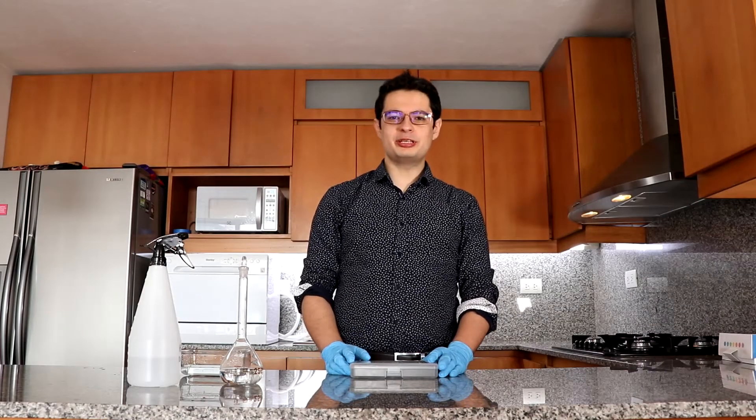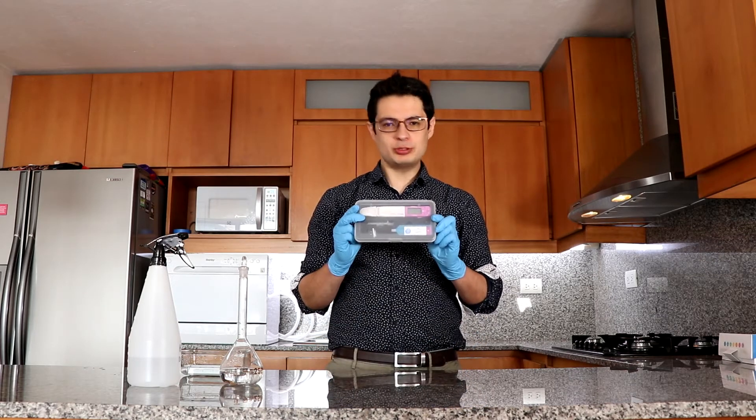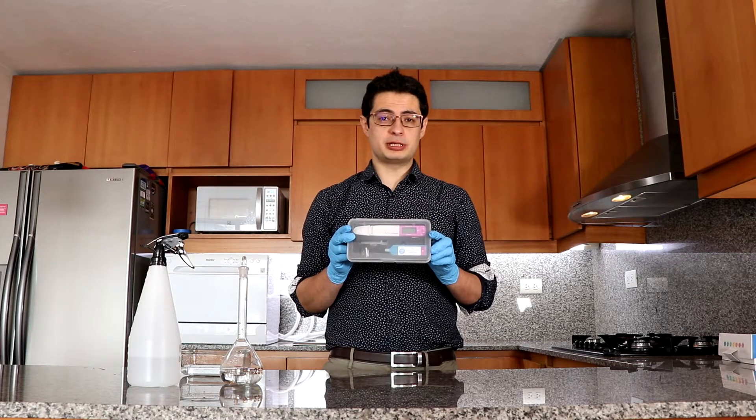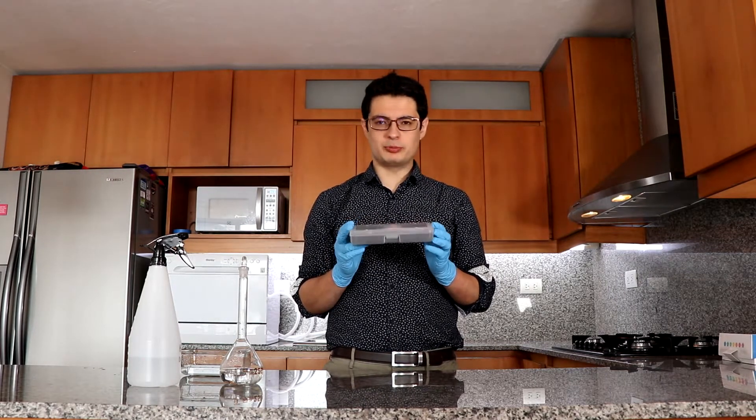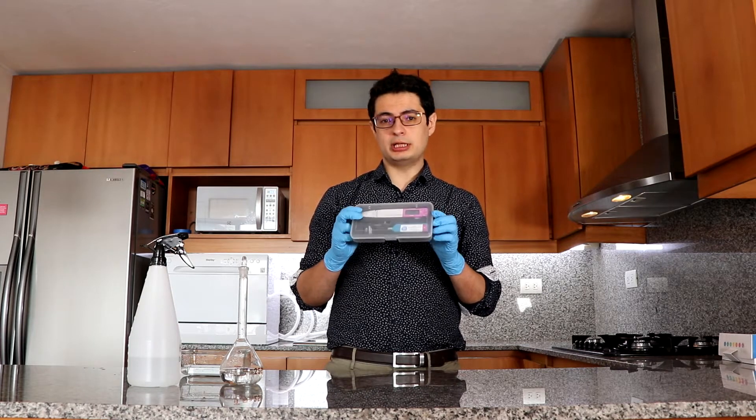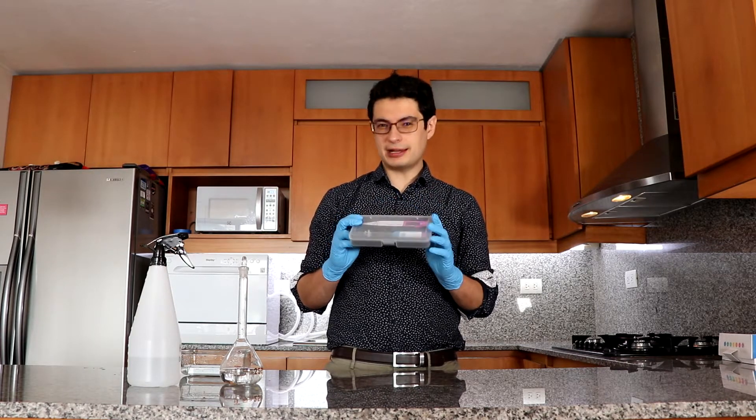I hope you enjoyed this video where we looked at this potassium ion selective electrode that you can use to measure the amount of potassium in your hydroponic solutions with an error of plus or minus 10 percent.